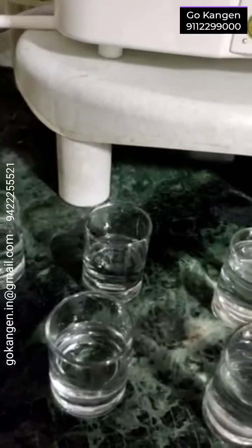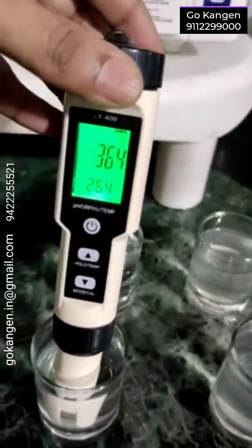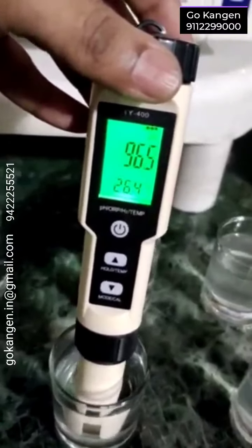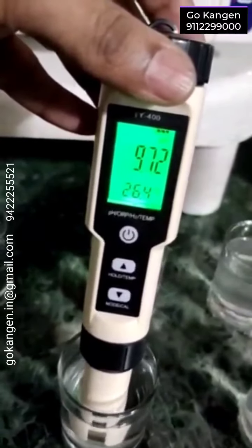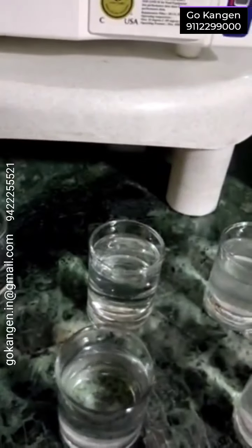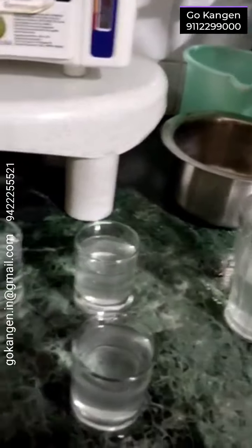And now, let's check for 9.5. A bit above 9.5. Of course, we have to calibrate this meter.